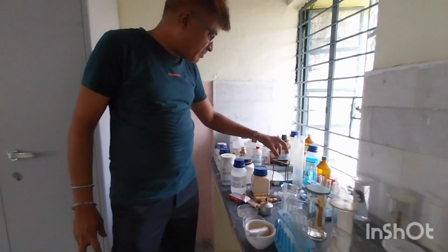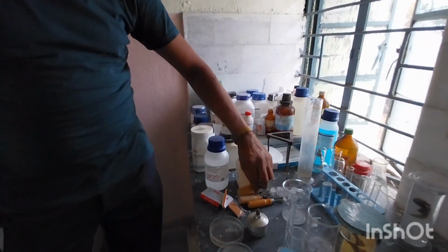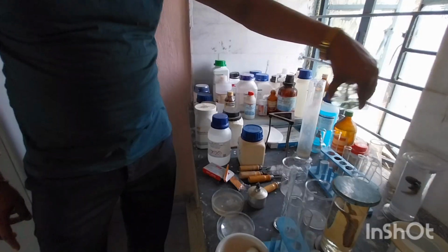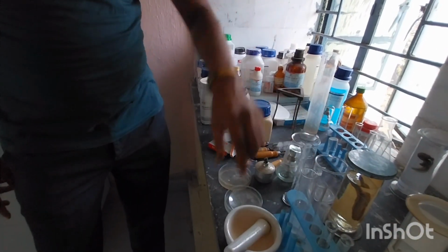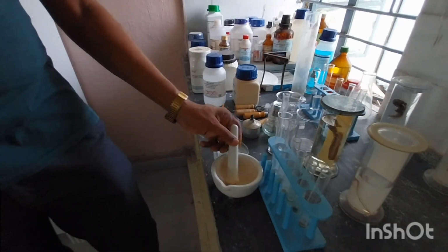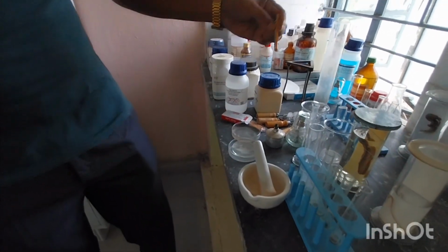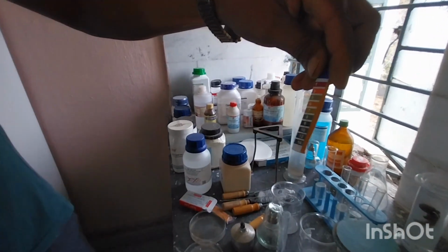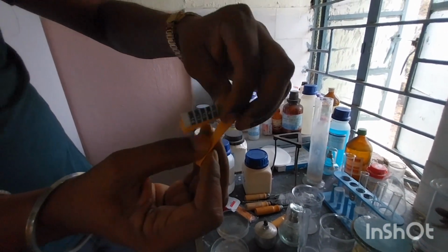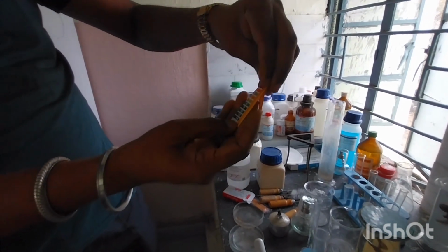And here some apparatus, tripod stand, test tube stand, test tubes. Here the test tube holder. These spirit lamps also are for boiling. A mortar and pestle, in the DNA practical we have to crush spinach or papaya. For that the mortar and pestle is used. This is a watch glass, petri dish, pH paper also here having different ranges. We have to use this pH paper and whatever the color change, we have to match it on this color.